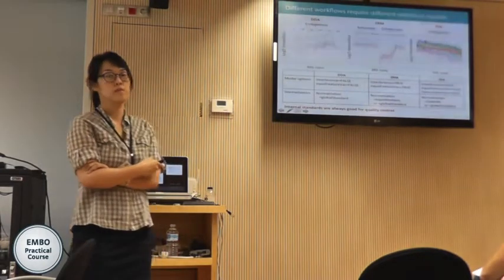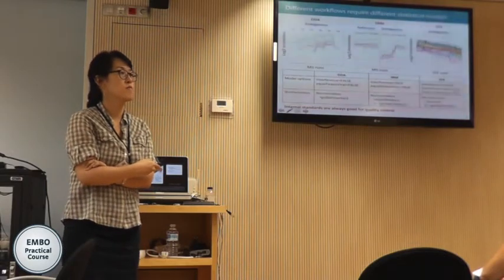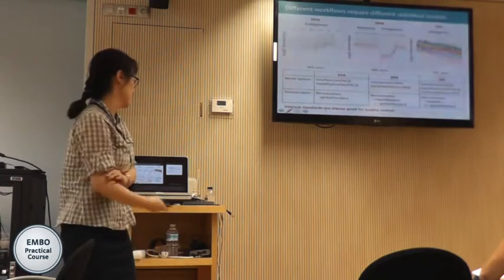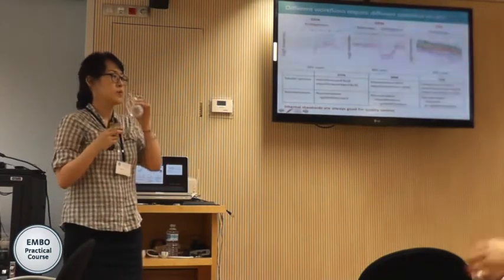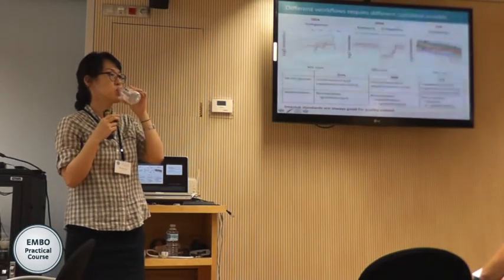And usually it's a safe thing to do generally. Even in SRM, if you think that some of these interferences are not systematic, just by the way you designed the experiment, maybe your assays were not well designed, then it's safer to say interference false, because then you would consider all of this as part of the random.